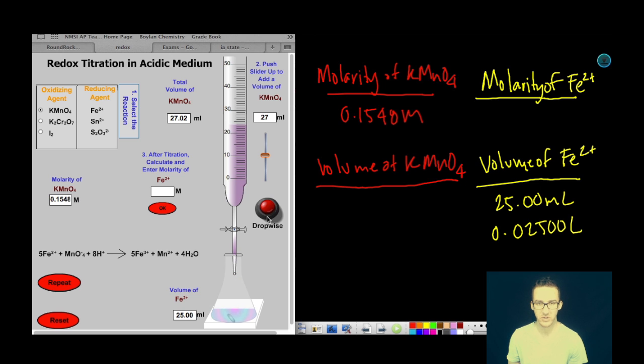And then I'm going to just start going one drop at a time. This part does get a little tedious, and you're going to want to cry sometimes, but just keep going. Drop-wise, drop it like it's hot. You want to make sure that you're stirring here after each drop. Stirring, dropping, stirring, and dropping. Yeah, this is what you're going to be like in the lab, wanting to go insane. Dropping it in, dropping it in.